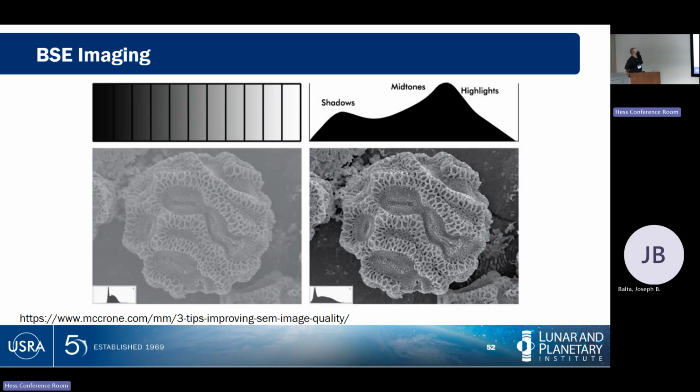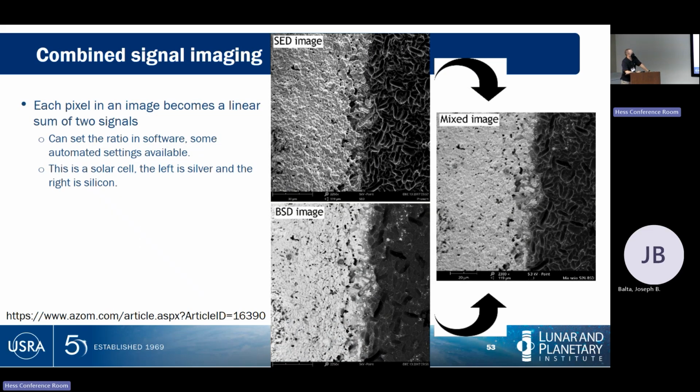Here is another example of that. This is using contrast to bring out the features of interest. So here, we have a big, broad contrast zone. We kind of zoomed in on this one. Here we've included some of the area in the background to bring out a better image of this particular material. Adjusting contrast is going to be something you're going to have to deal with.